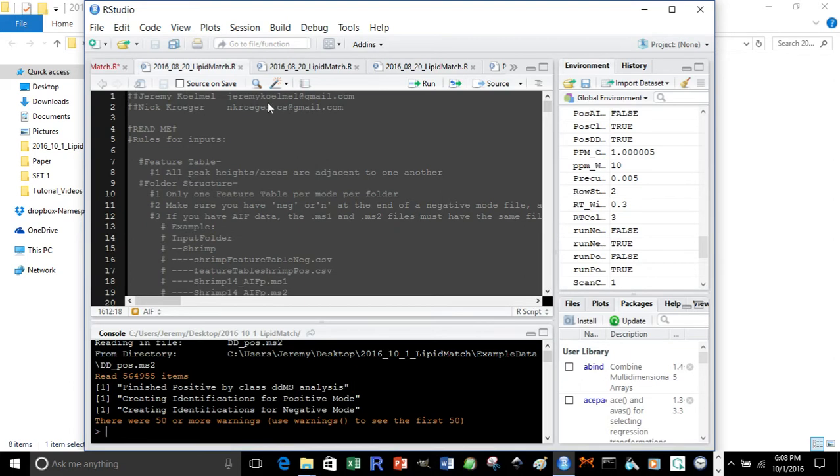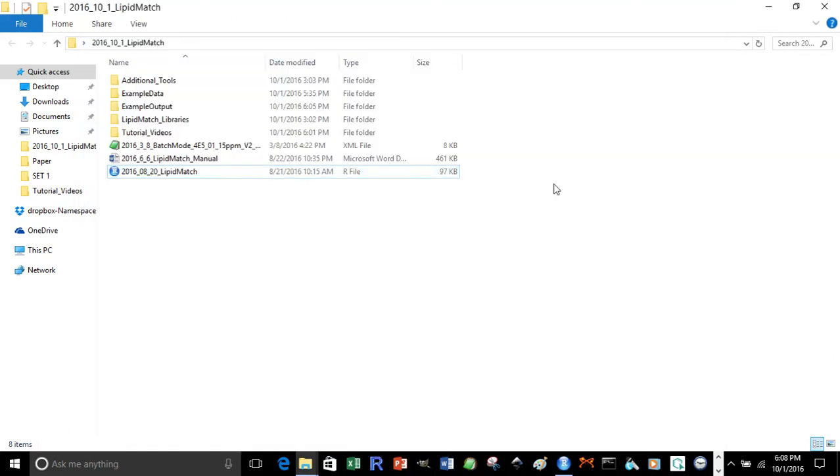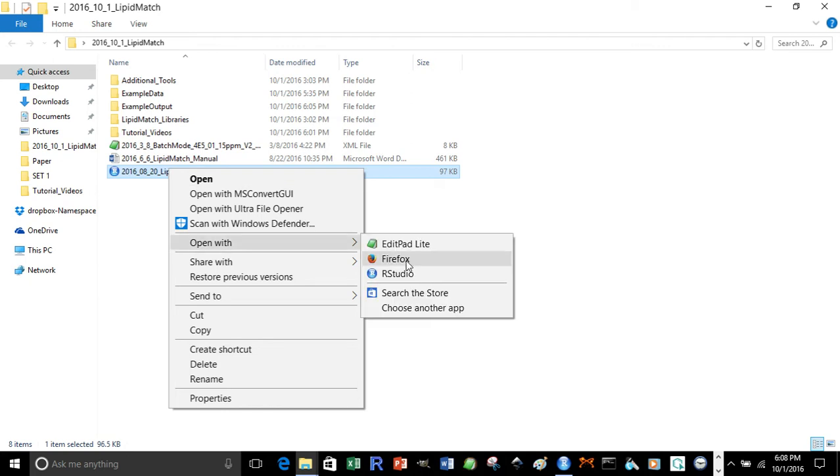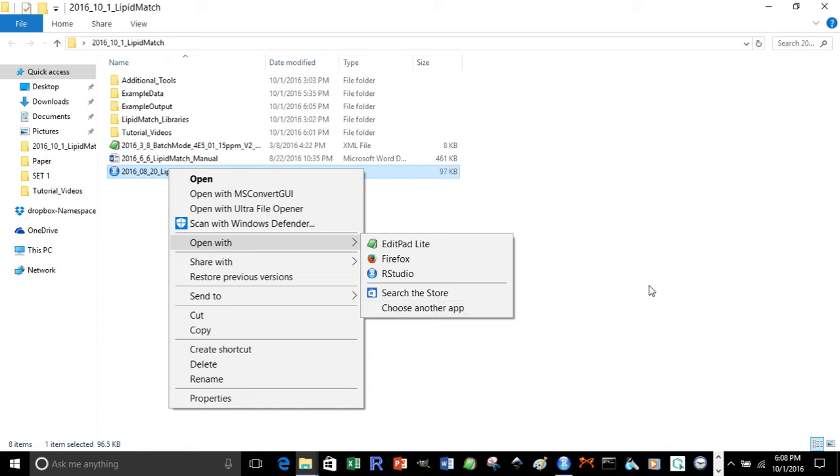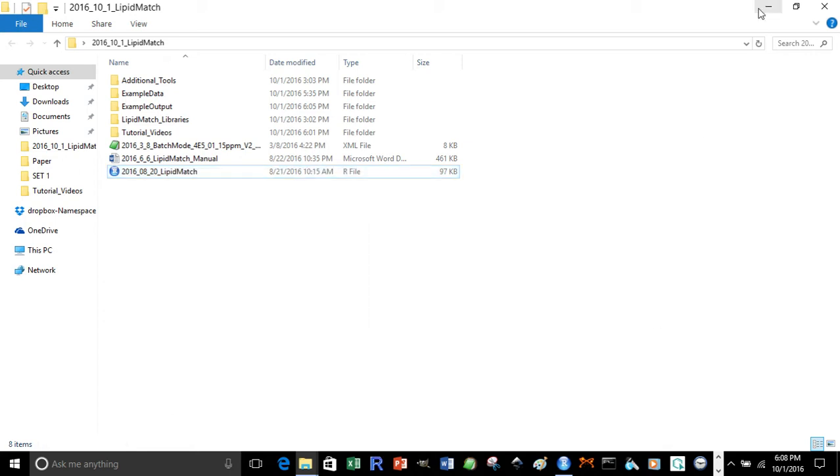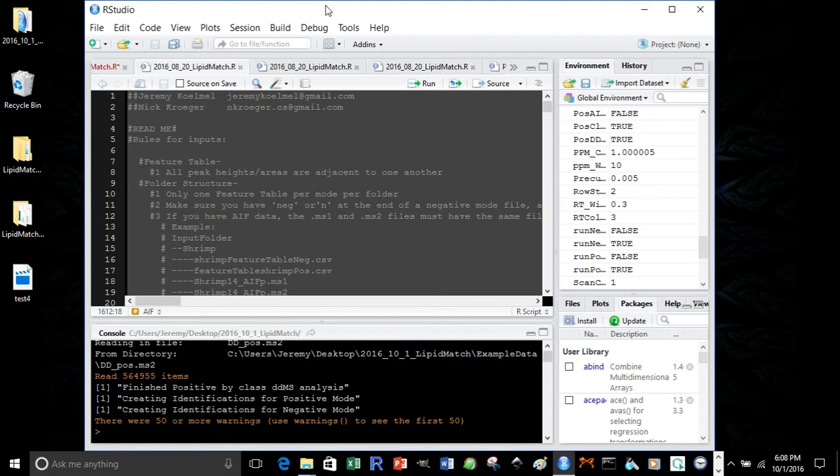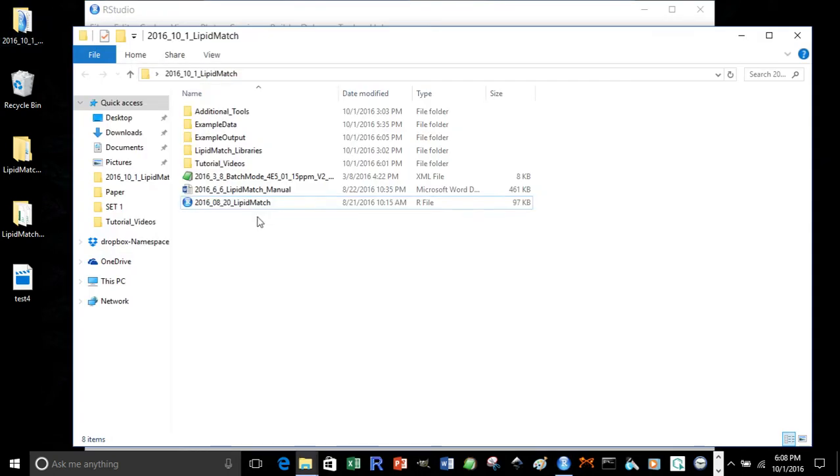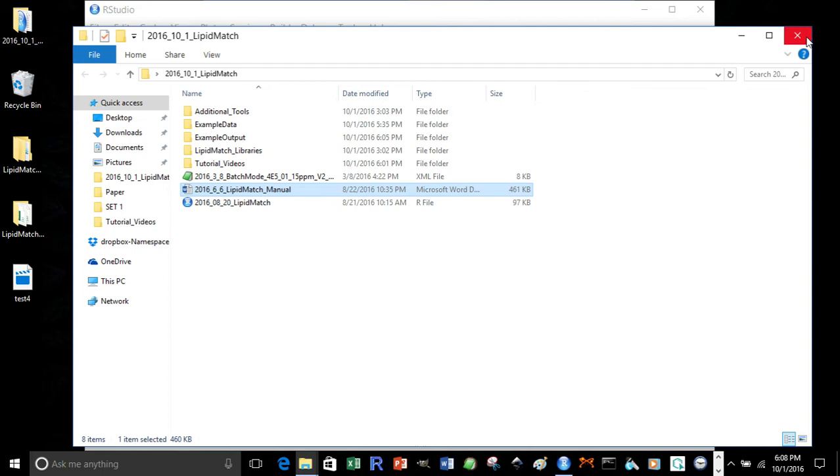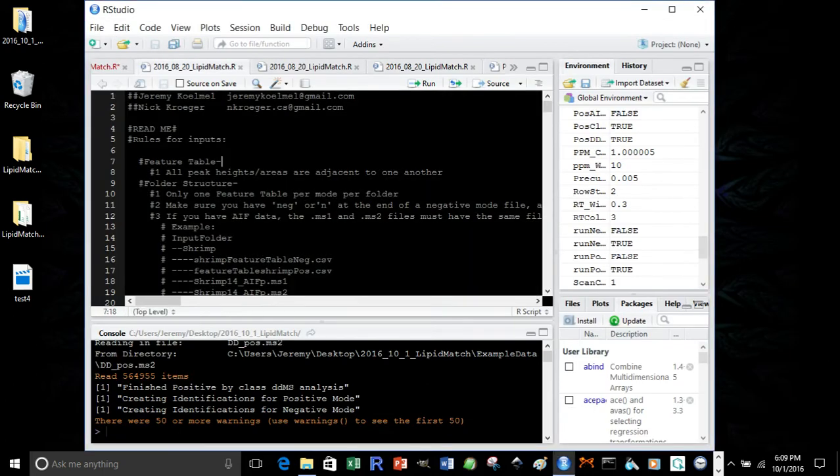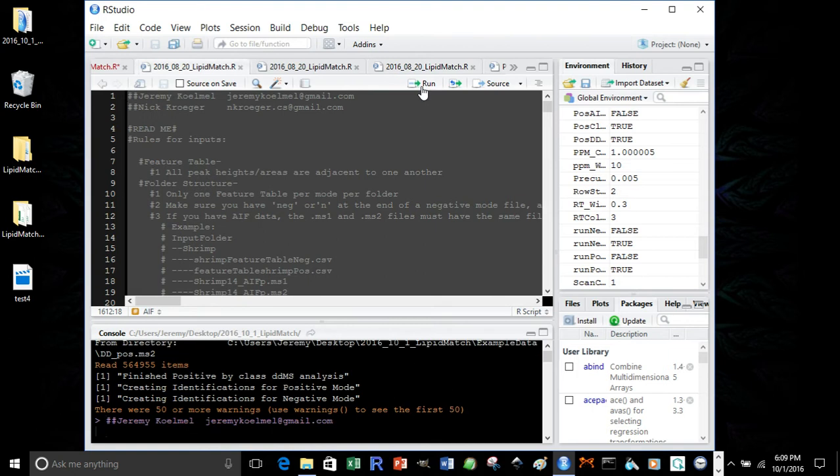Now it opens up in RStudio. If it doesn't originally, you can go to open with and then choose RStudio, and if RStudio doesn't appear, you can choose another app and navigate to find RStudio. Once you've opened it up in RStudio, and RStudio can be downloaded, there's a link accessible within the LipidMatch manual. Then to run it, press Ctrl-A to select it all, and click Run.